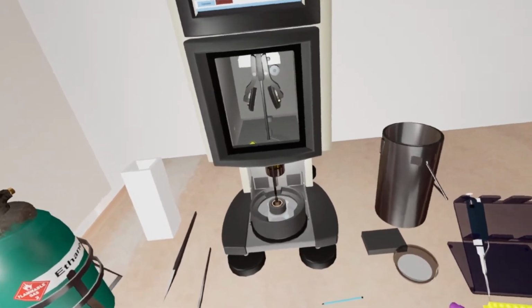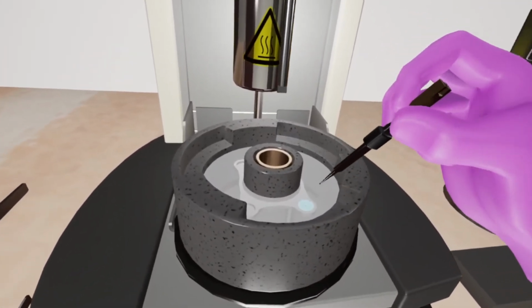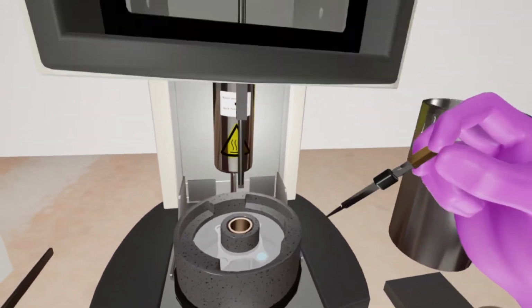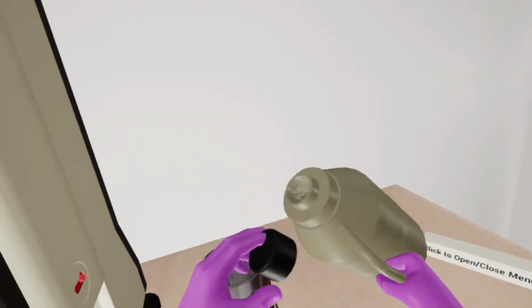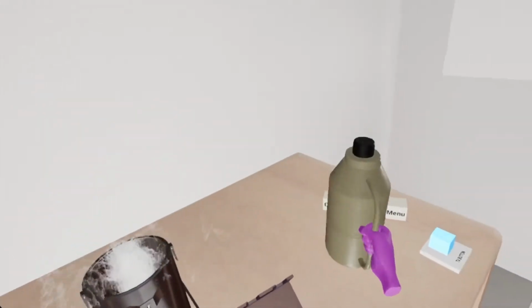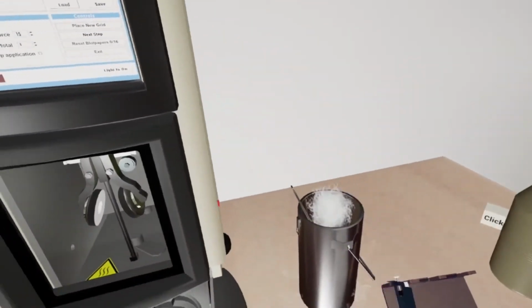Now we are going to transfer your grid to a grid box for storage. Carefully insert the grid into the blue grid box that's already in the workstation. Okay, fill the temporary storage dewar with liquid nitrogen to cool it down. Pick up the large grid box tweezers and put them in the temporary storage dewar for cooldown.